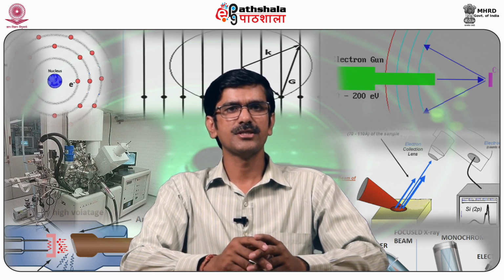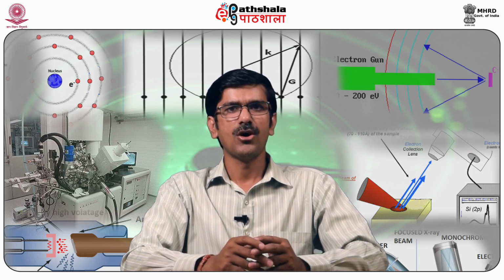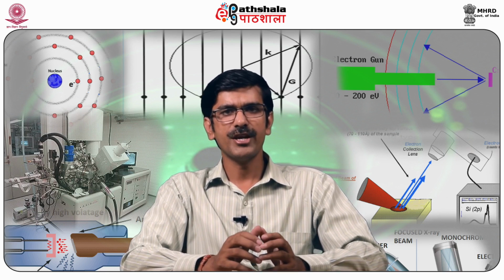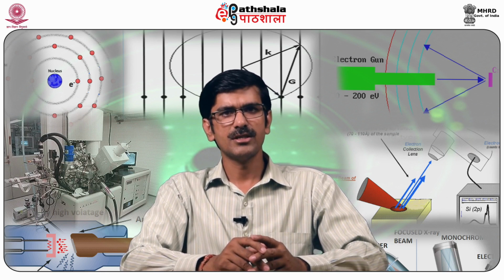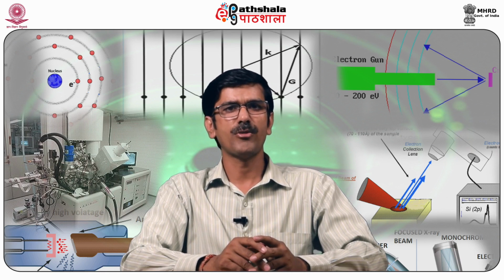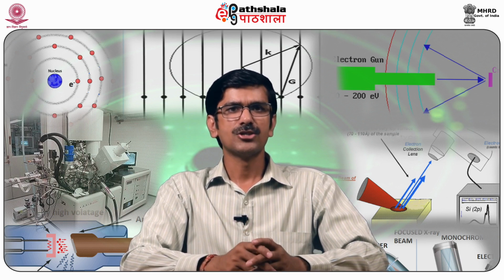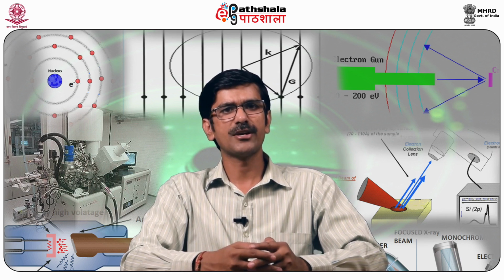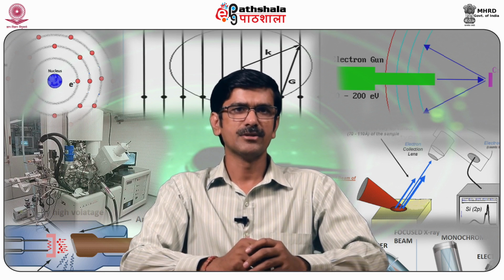True scattering process. Virtual state is a short-lived distortion of the electron cloud which creates molecular vibrations, and the order of tau is less than 10 to the power minus 14 seconds, which is a very short period. Strong Raman scatterers have distributed electron clouds, that C double bond C and pi bonds are the examples.